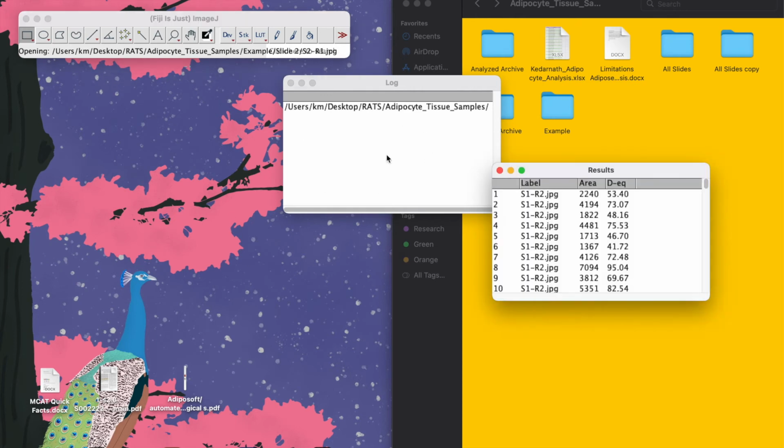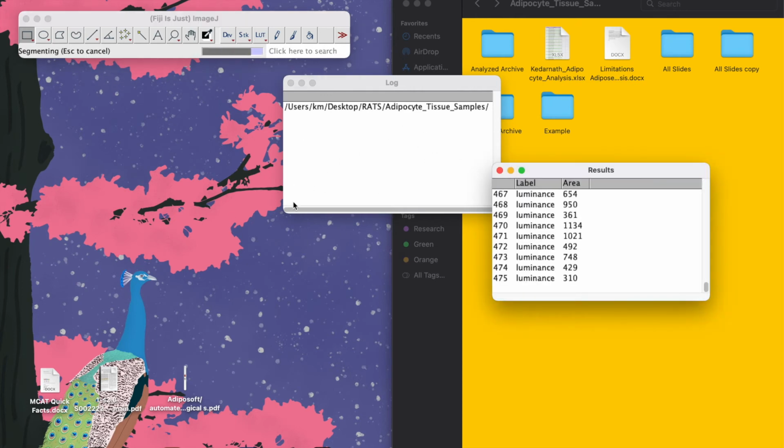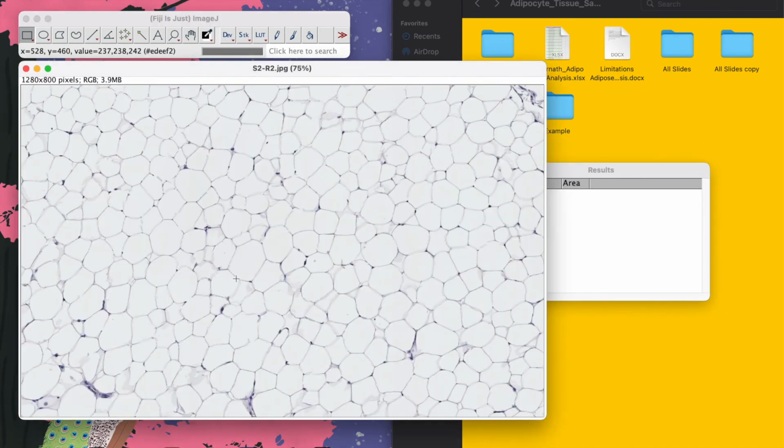So that's the first slide, and this is going to be the second one.